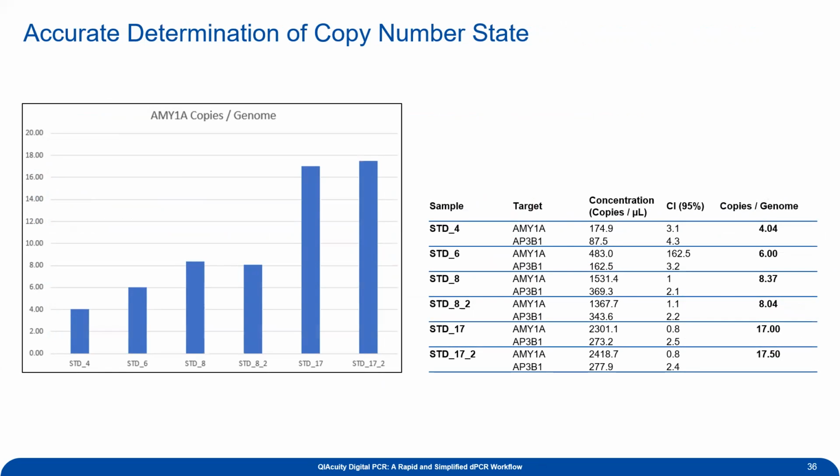So this is why digital PCR tends to be a really great tool for copy number variation, provided you don't have heterogeneous samples, you're going to get these integer calls. Even if you do have heterogeneous samples, things like fine needle aspiration biopsies, where maybe 10% of your cells are cancer but 90% are wild type, you can still detect copy number changes and correlate that back to your actual pathology.